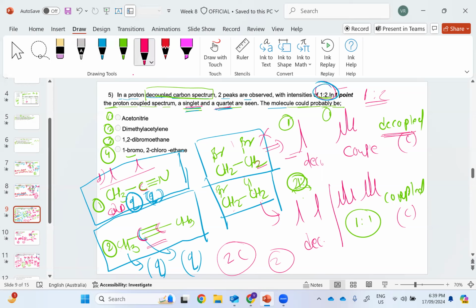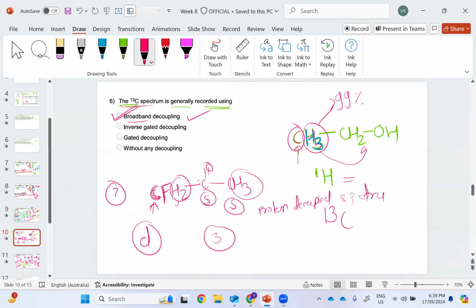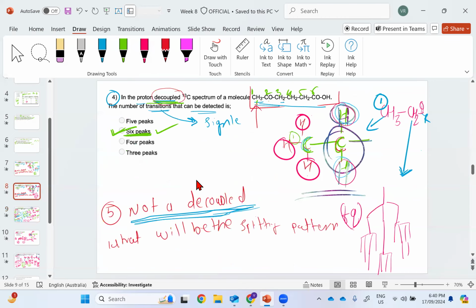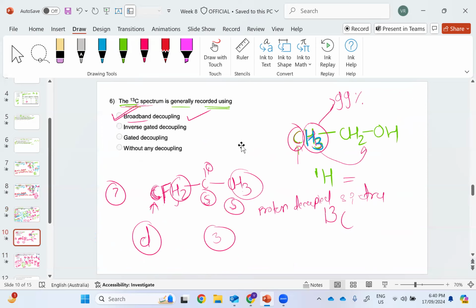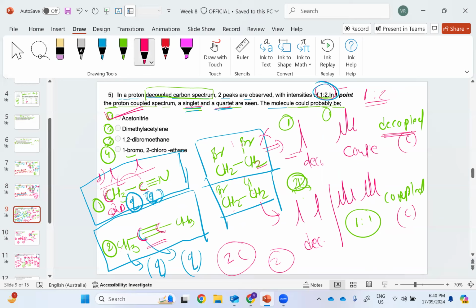So the answer given here is acetonitrile, because it looks like they haven't mentioned the splitting due to the 2JCH, right? As we saw in the earlier example, although in the proton we can observe the splitting due to the adjacent CH3 also, in this one, since this carbon can also couple with this terminal CH3, because of these protons it will show 2JCH coupling, right?